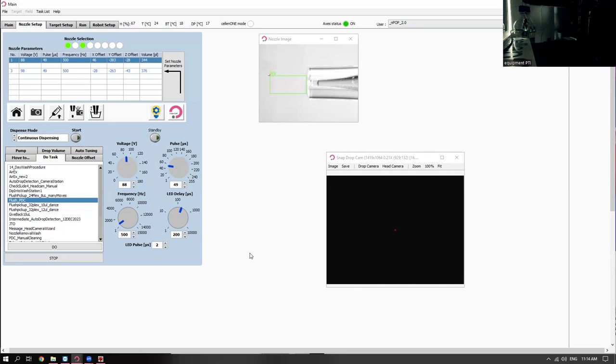And if you love that, to give images when you take that one, every time you take a cell or drop it into each slot, yep, and into each well. So that image I can correlate with which well it actually came from. Yep. And basically, if there is some doublet or something like that, I should not actually proceed with this thing. I think it all depends.